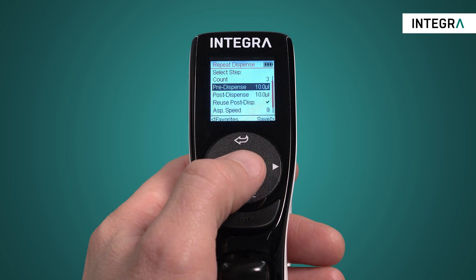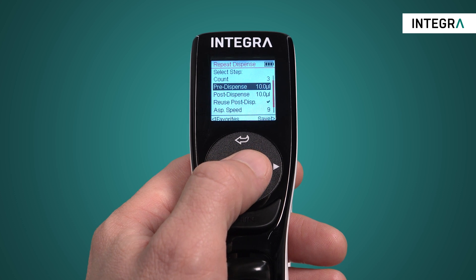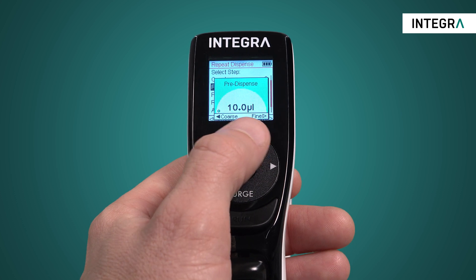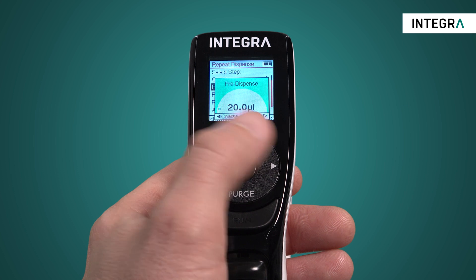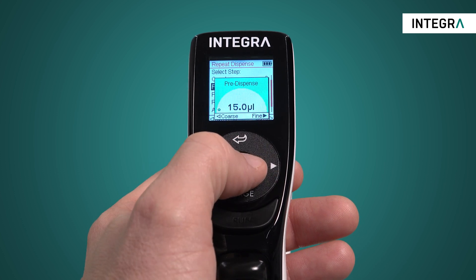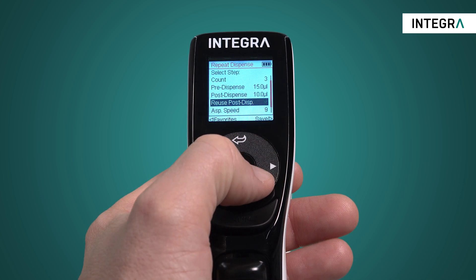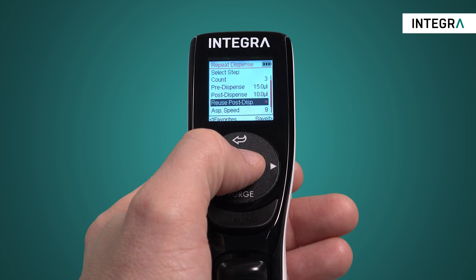With Integra electronic pipettes, you can set the volume of pre and post dispense. Typically it would be about 3 to 5% of the full volume of the pipette for either one. You can reuse the post dispense, meaning it will stay in the tip after the program is finished so that it will be included in the next aspiration.